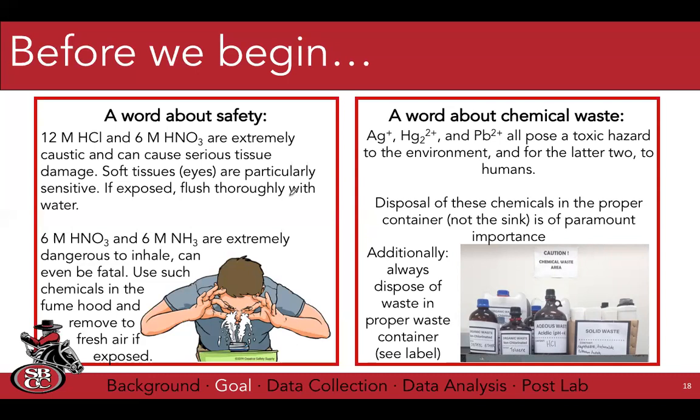You should always be aware of what chemicals you're dealing with. Just because we're pouring it, we always have to pour our waste in the waste container in this experiment. But sometimes we know, hey, this is really just water. Today we really specifically want to make sure we're putting our waste in the correct containers. When you get off to a job and you're working in a lab, not all waste containers are created equal, unlike our lab simulation. So you're going to want to make sure that you read the labels and put the waste in the correct container, because, and I'm not positive on this, it's possible that some of these heavy metal wastes have to be disposed of differently.